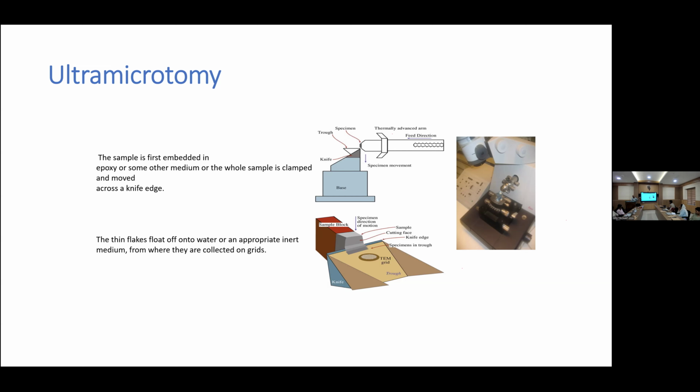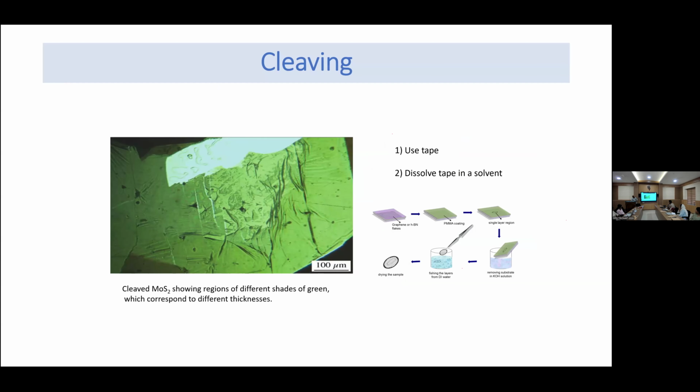So that is the normal type, and next is cleaving. This is for when you prepare something on glass slides, something coated on glass slides, then we can follow this. It is not like this, because here they are saying we just cut the slice and then dissolve the background, then take this. Like if you painted on some clay and then put it in water, what will happen? The clay will dissolve and the painted thing will remain as a film. So we just take it like that. And if we prepare this film on a glass substrate, then we cannot follow this method.